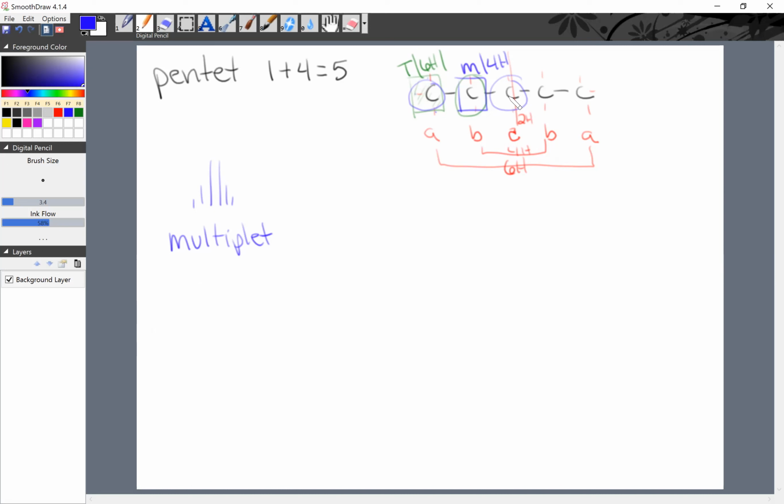Now this one, again, I know it has symmetry, but this particular one, what color haven't I used? Let's use pink. It has 2 around it, and so it's peak plus 1, 2, 3, 4, and so that one would be a pentet that integrates for 2 hydrogens. Okay, so that's the way we would go through. And again, these multiplets get very ugly, so anything that you can't see, or usually past 5, you can just call it a multiplet. All right, let's do some more examples.